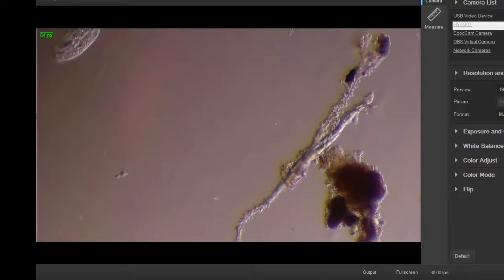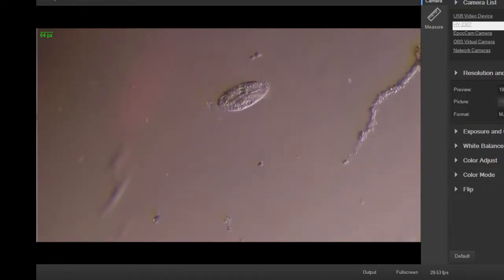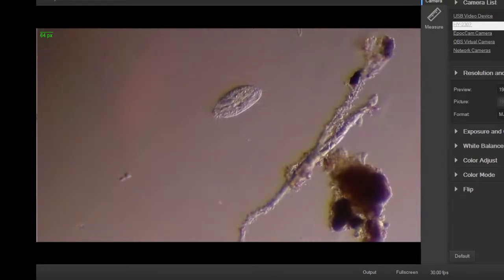Oh, now he's changing positions. Luckily, he's fairly slow, so it's able to track him quite well. And I'm going to briefly go in for a closer look, because it's not moving too much. Let's try that. Let's do a quick close-up. Where'd you go, buddy? There we go. Nice. Now, it's still moving quite a bit, but I can try to chase it here. Trying not to get people too seasick. There we go. So there's some nice colors in there, partly from its own structures and stuff it's eaten. Yeah, he's moving a lot more than I expected.